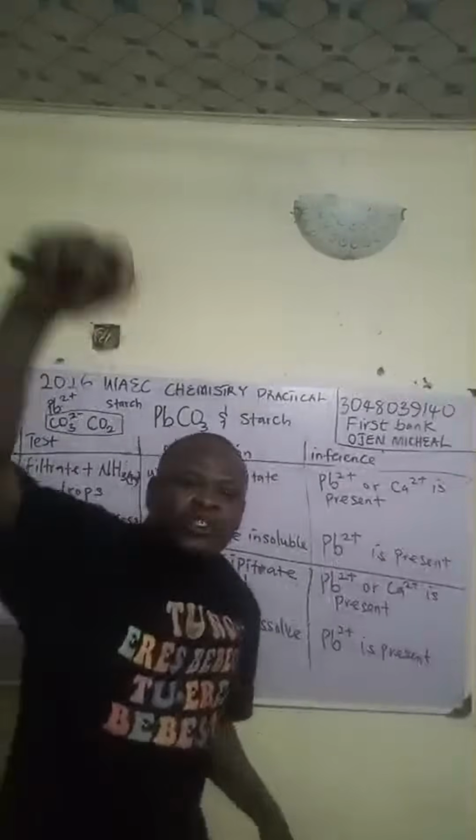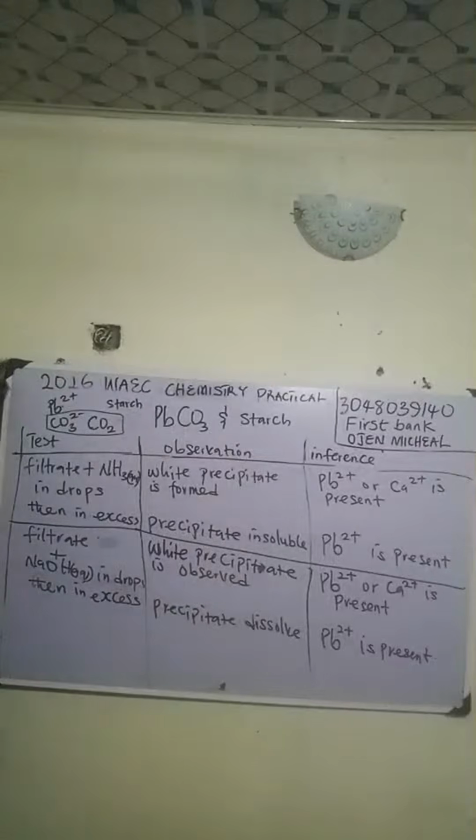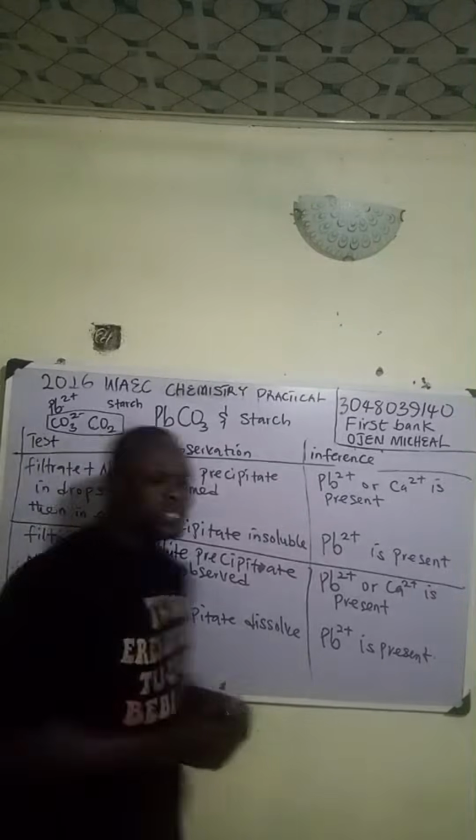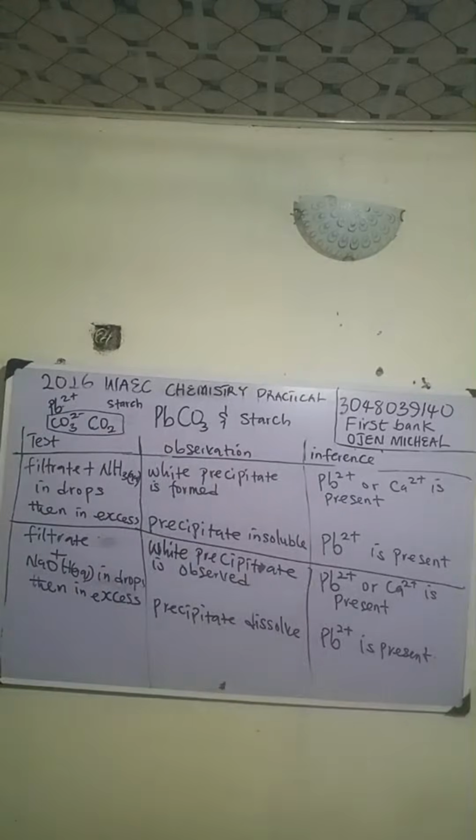Now, for emphasis sake, in case in future you are asked to confirm, you add potassium iodide. In fact, let me not put that one because there is no need. I have already posted salt analysis video. Yes, you can answer the question without carrying out the practical. That's what I'm giving you now. Go and read this thing. There is no point of you at the practical, because if you carry out the practical, this is what you are going to see.